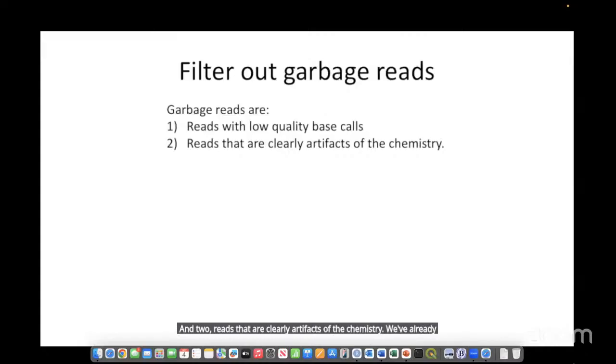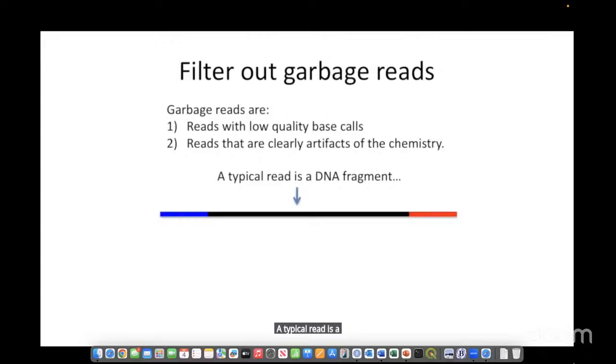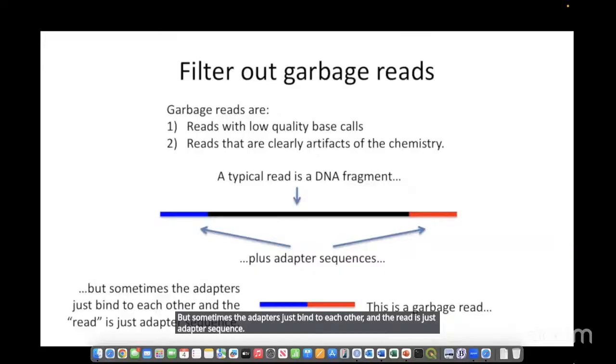We've already talked about low-quality base calls, so now let's talk about artifacts from the chemistry. A typical read is a DNA fragment plus adapter sequences. But sometimes the adapters just bind to each other and the read is just adapter sequence. This is a garbage read.